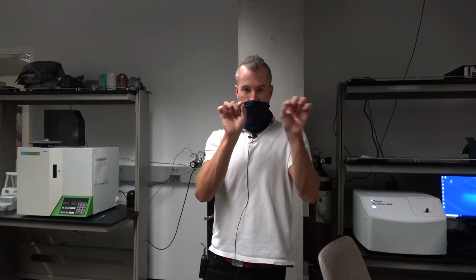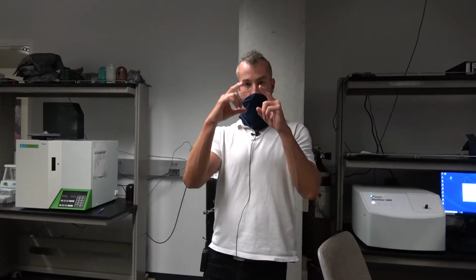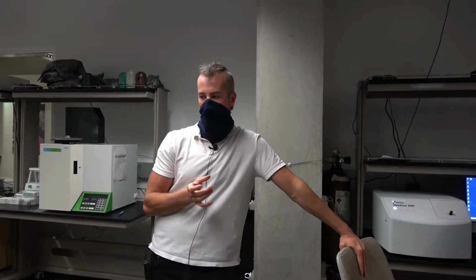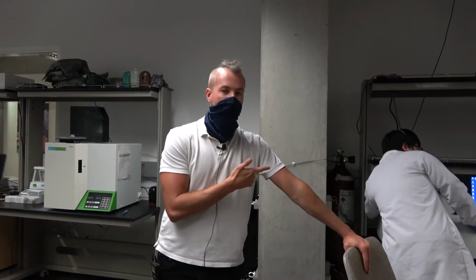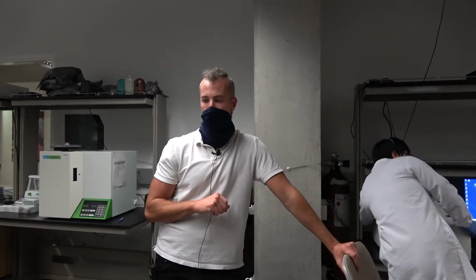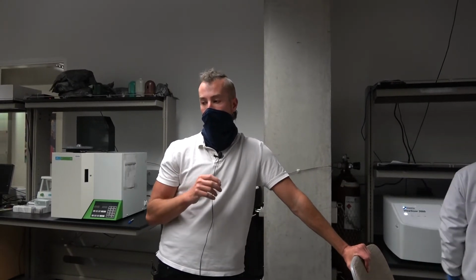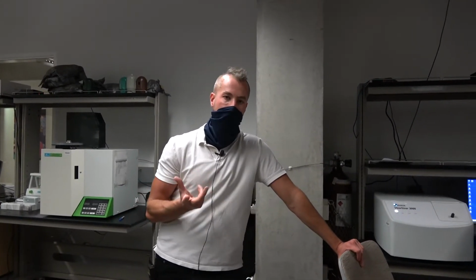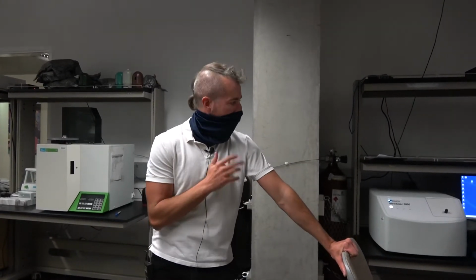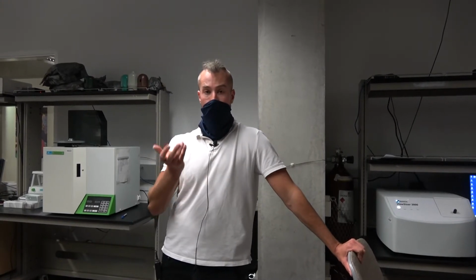So we dilute our sample. That's one thing that's absolutely critical, is having the right dilution factors. Otherwise, all of those airy disks from different particles are going to overlap and there's no way to resolve them. So the dilution factor is really key. Tengyu He is a PhD student here in the department, and he's an expert user of this instrument, and he's going to show you in a little bit some more details about preparing the sample and how to get the dilution factors correct.